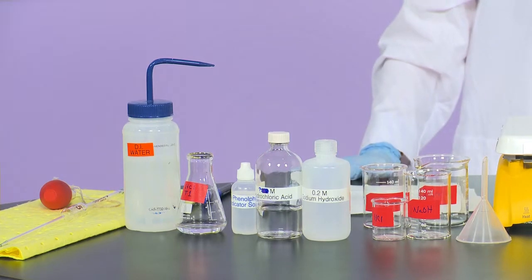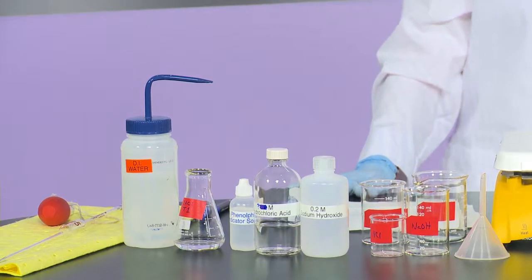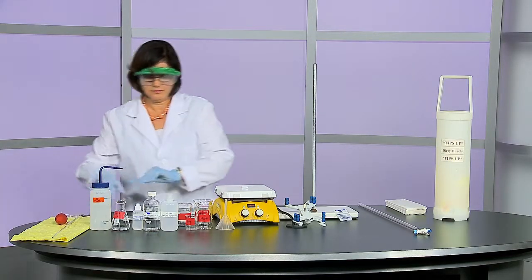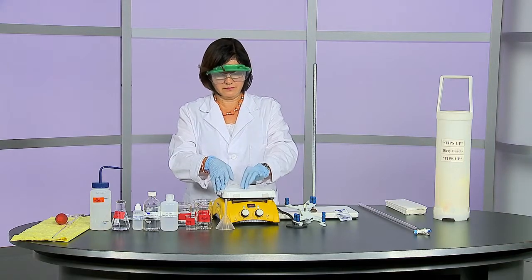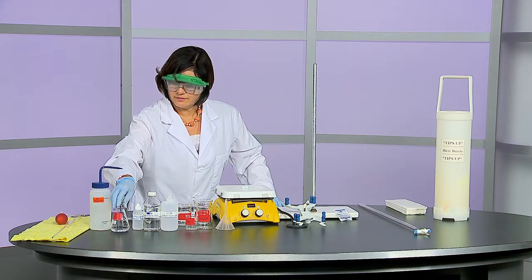The analyte may be in solid form or in aqueous form. If it is in solid form, you will need a balance. If it is in aqueous form, you will need a pipette and pipette bulb. You will also need to mix the reaction constantly, so an electric stirrer and magnetic stir bar are convenient to use. If you don't have these, then you will need to swirl the flask constantly throughout the titration.